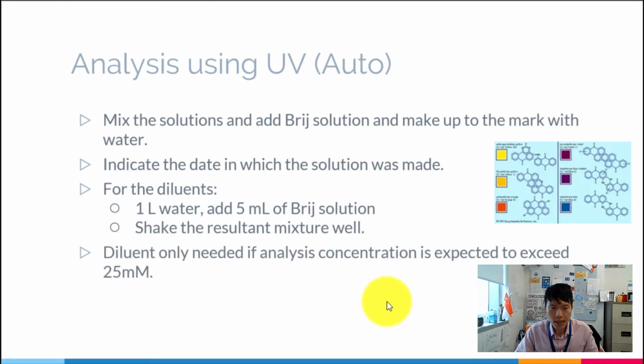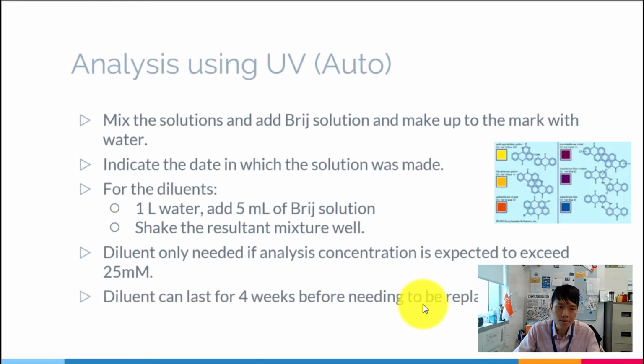You only need to dilute if you expect the concentration of your analyte to be more than 25 millimolar. And the diluent can last for 4 weeks before you need to replace it.